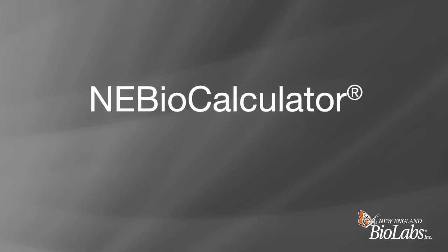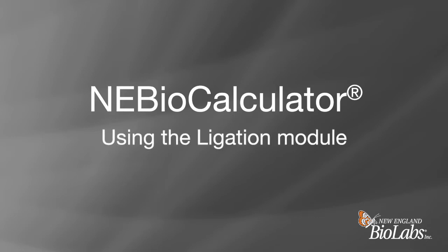NEBioCalculator is an easy-to-use tool that helps with various biomolecular calculations. The NEBioCalculator ligation module can help you plan a successful ligation reaction as part of a restriction cloning workflow by optimizing the molar ratio between your vector and insert DNA.